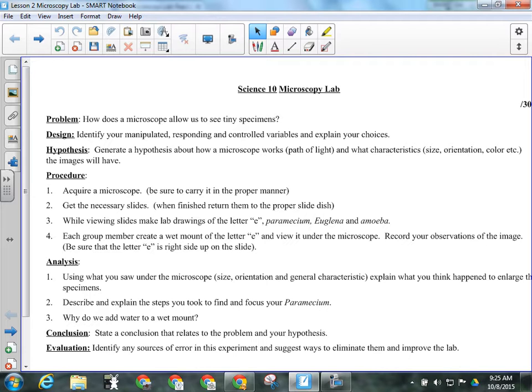And if you machine a piece of glass to the right shape, you can bend the light so that it does what you want, right? You might want to converge the light. If you burned ants with a magnifying glass when you were a kid, that's what you were doing. You were converging all the light that landed on the lens to one little point of hot intensity. That's what the lens was doing. It was directing all of the light rays that came into it to a single point.